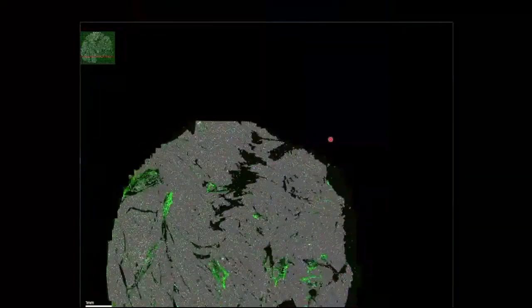You can already also see, for example, this here is one cardiomyocyte, and you can see the transcript variants of nuclear transcripts, perinuclear transcripts, and transcripts which are further in the periphery. And I think you can see this here and in other areas of the tissues. And I think these are really the exciting features of this technology. So maybe using this video, I would like to further bring this resolution to your attention.